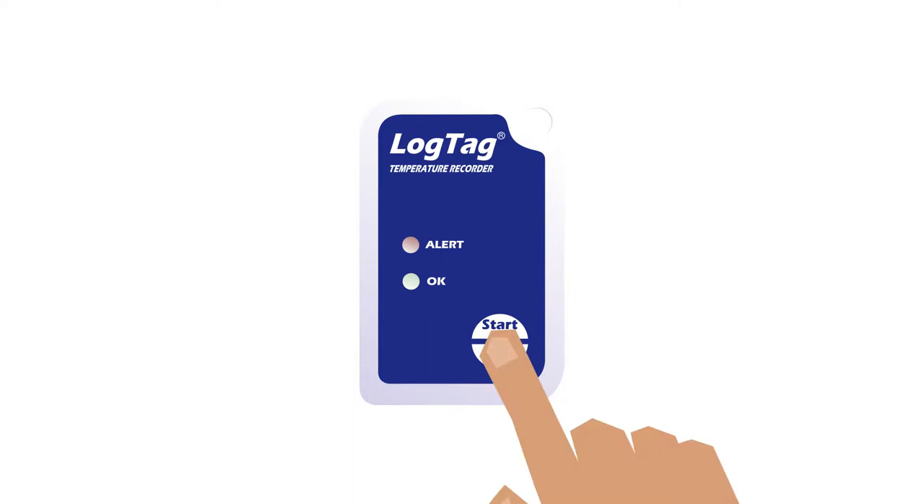To start your logger, press and hold the start mark button until the red and green LEDs start flashing, then release. Your logger is now recording.